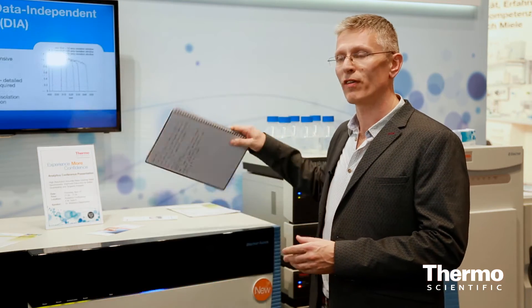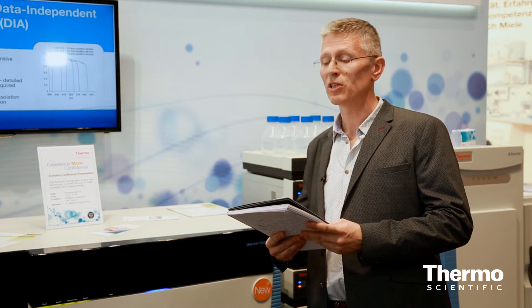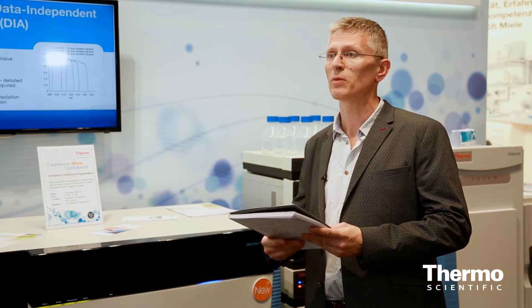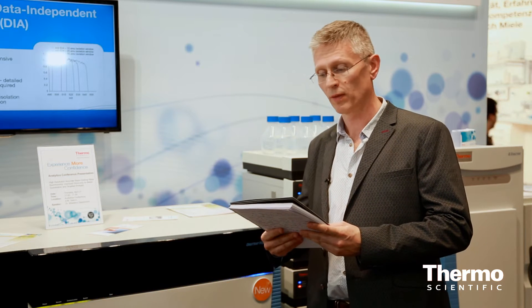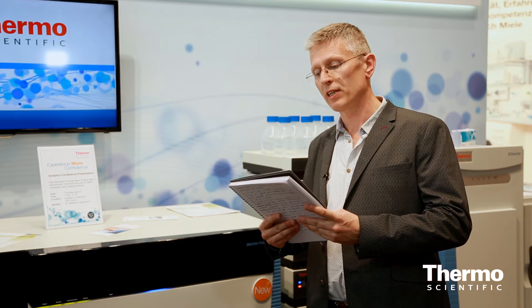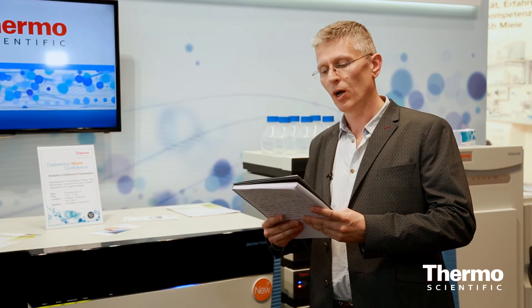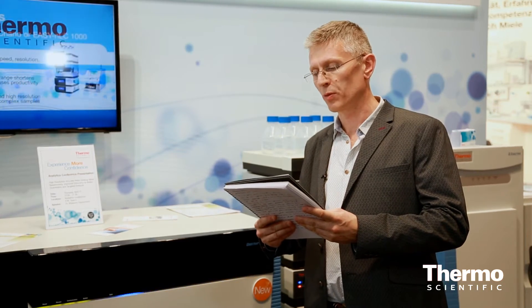I want to give you a quote from Professor Runa Linding. He's at the DTU in Copenhagen, and he was one of the first customers to adopt fusion technology in the world. He said: 'We love the Fusion. It allows us to get 40% more data out in our global phospho studies and go into tiny tissue samples. We are breaking every record with this instrument. The only problem is we only got one.'